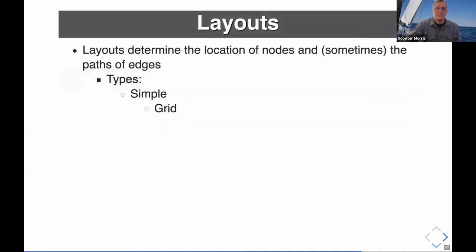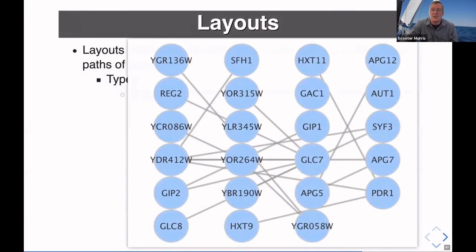Okay, layouts. Layouts determine the location of the nodes and sometimes the paths of the edges. A simple layout is grid. It's very, very fast, and it's probably marginally useless. But at least it gives you some idea of what your data looks like.